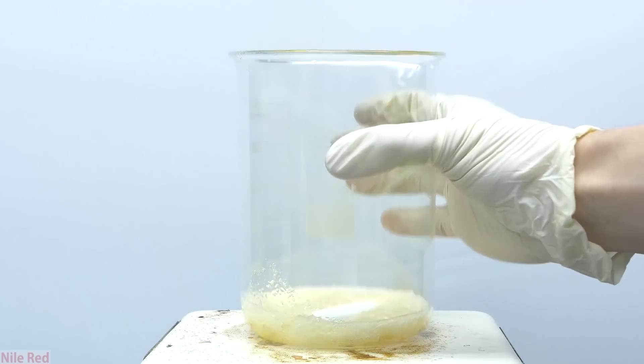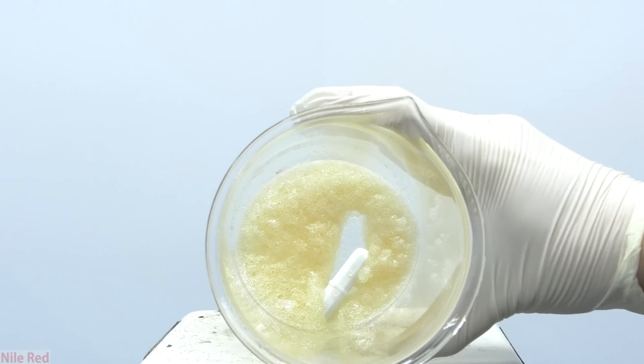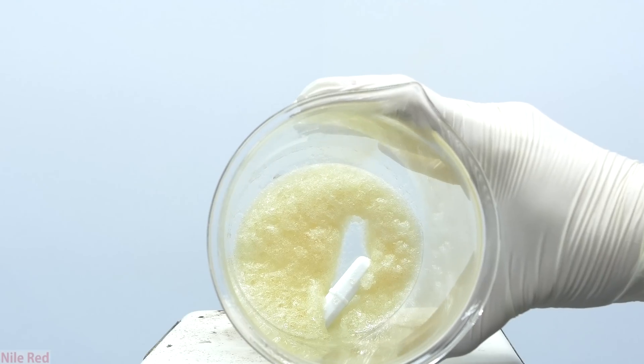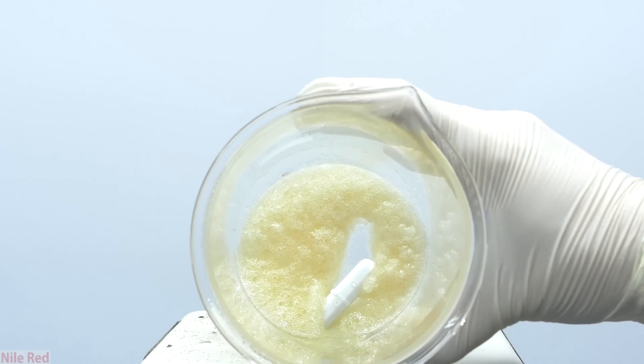As the solution cools, it will eventually solidify as oxalic acid starts to precipitate out. The oxalic acid here still looks a little bit yellow due to the presence of nitrogen dioxide, but that will eventually go away.